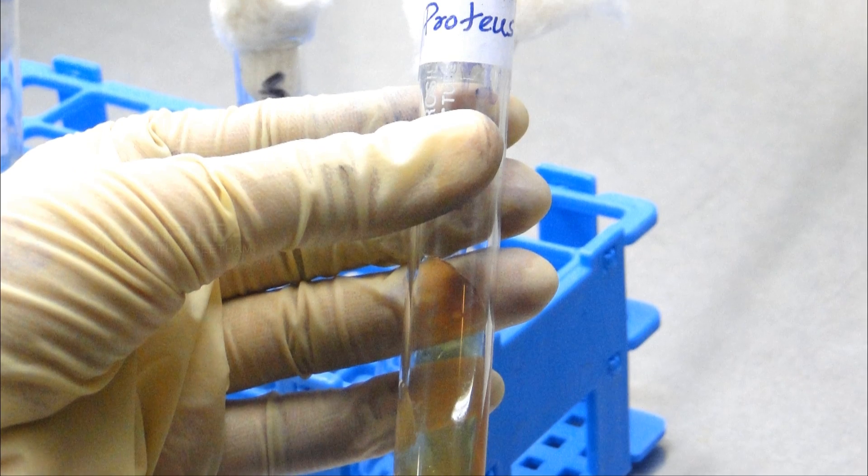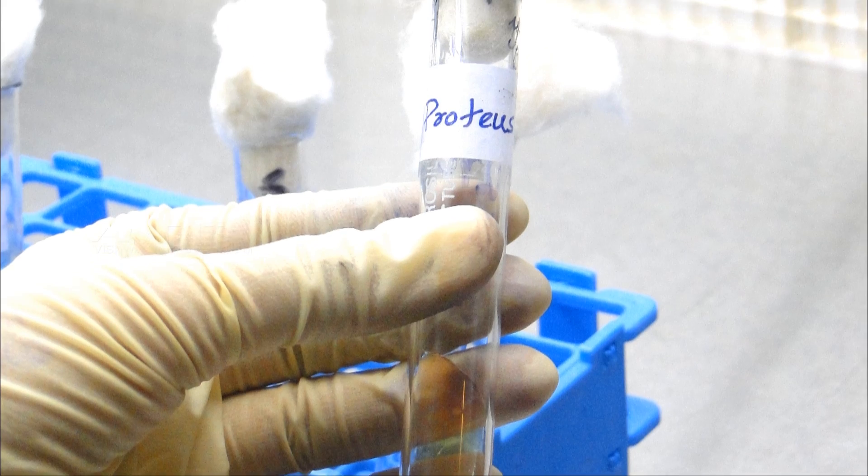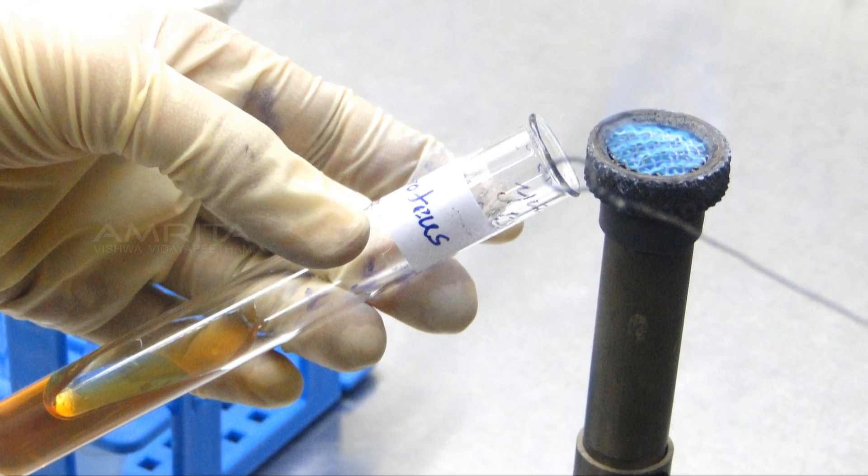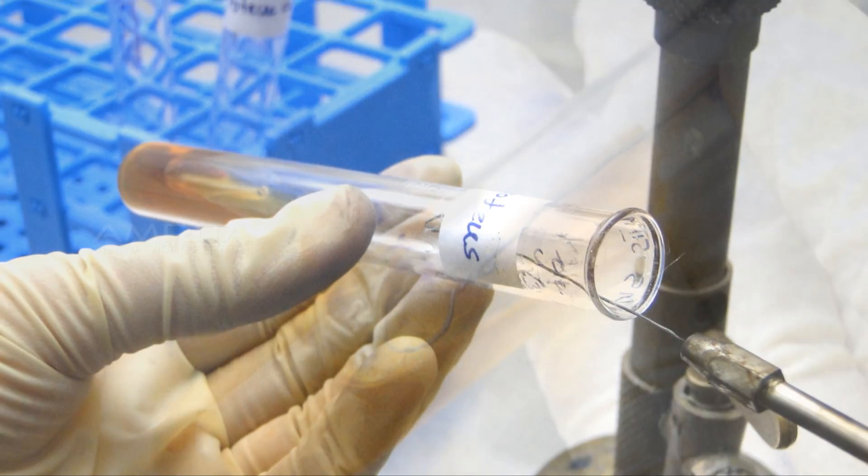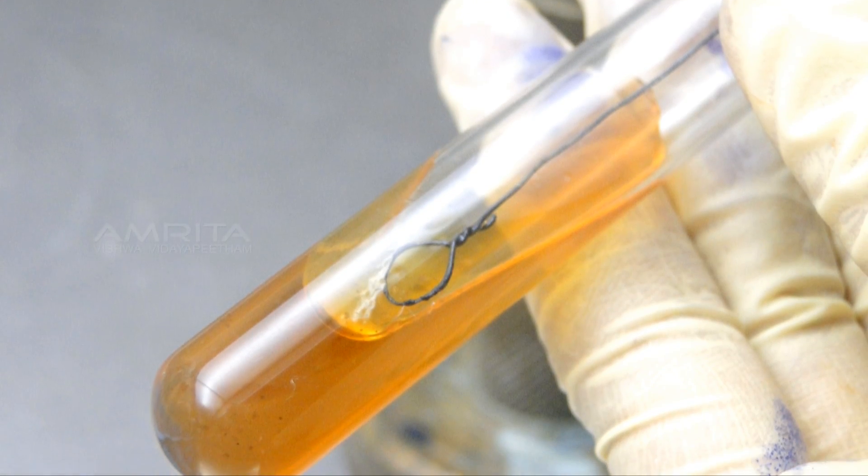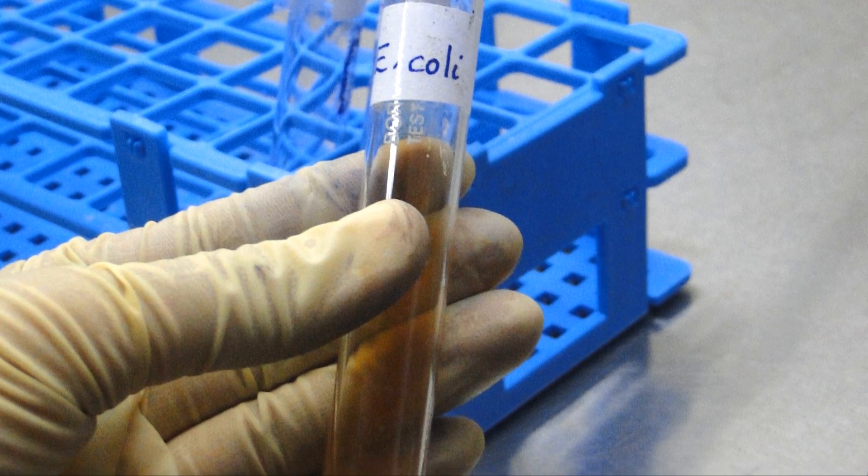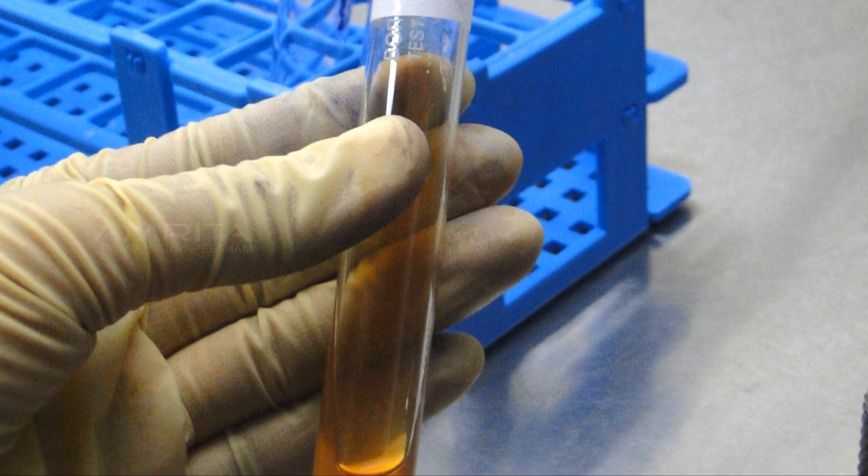Take a sterile urease slant tube from the rack, remove the cap, and flame the neck of the tube. Insert the inoculation loop and streak the slanted surface of the tube in a zigzag manner. Again, flame the neck of the urease tube, cap it back, and place it in the test tube rack.